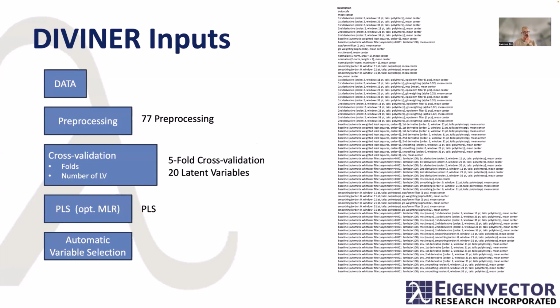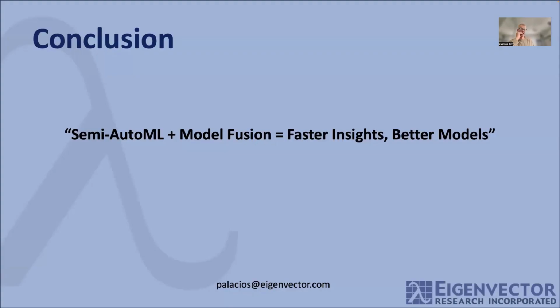Oh, okay. You don't have my finishing slide. What we say here is that it isn't to replace the analyst; it's to make the analyst better. That is our goal with Diviner, and it's not an AutoML that's going to make all the decisions for you. Instead, we've tried to create a system that will make the analyst better and lead to some insights. The analyst has a chance to have some input and might actually learn something. Very nice. Yeah. So that's it.